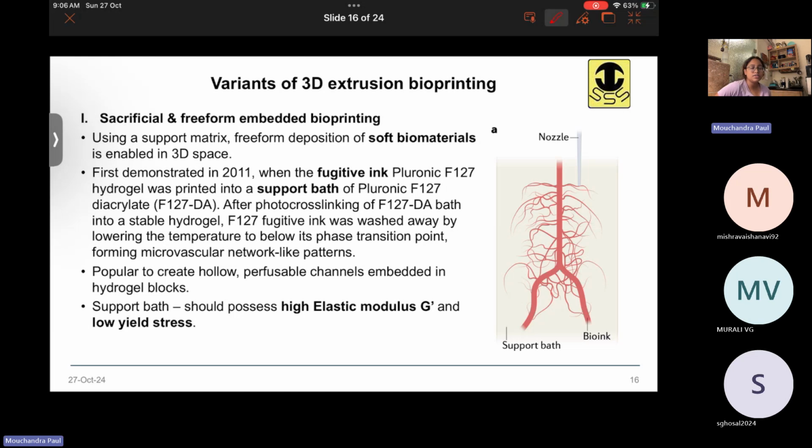So any questions so far on all the 8 types of bioink designs that we discussed? Ma'am, these all are standard ones, right? But for everybody, they will have an idea, right? For this type of tissue, I need to use this type of cells. So in those times, they will come up with their own bioink, or even if they do, they only use these kind of techniques.